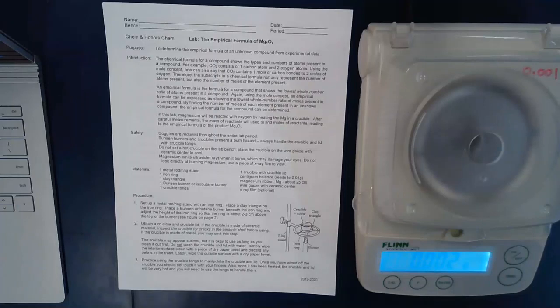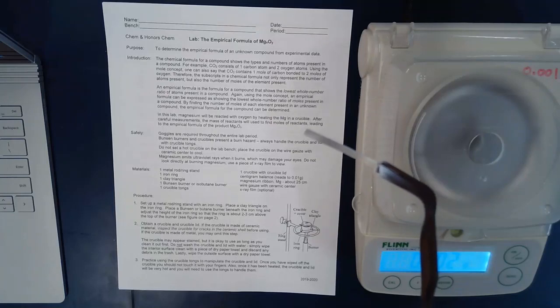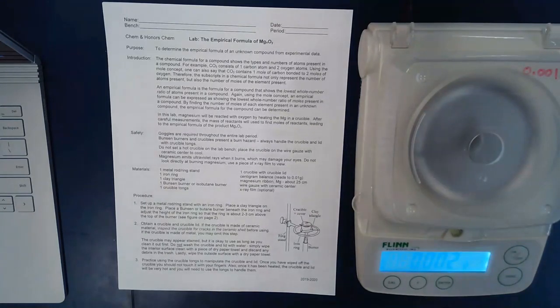Now, when you heat magnesium up to a high temperature, around 800 degrees Celsius, it actually spontaneously reacts with oxygen, and it reacts pretty dramatically. And so I'm going to demonstrate that quickly. I have a strip of magnesium here I'm holding with crucible tongs. I'm going to put it into the flame of a Bunsen burner that's next to me here. I don't want to light the camera on fire, so I'm going to go out of the screen. I'll light the magnesium, and we'll see how that looks when the magnesium reacts. Whoa, don't look at that. That's pretty dramatic.